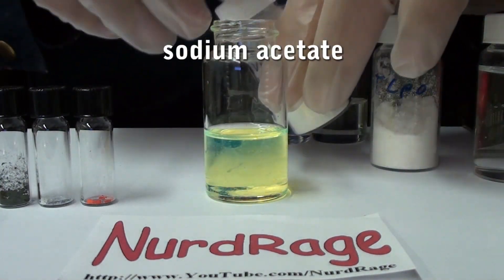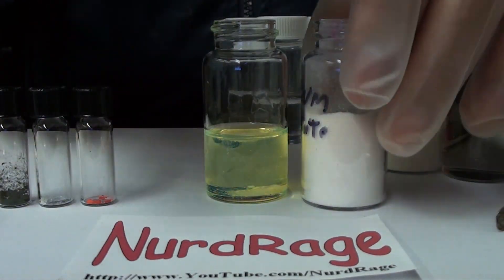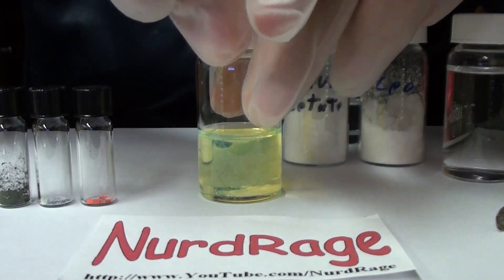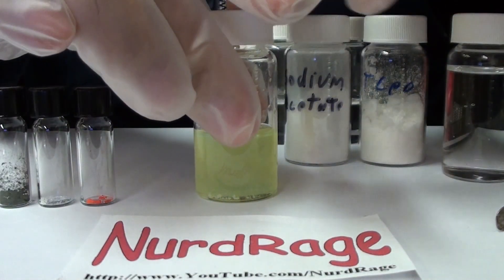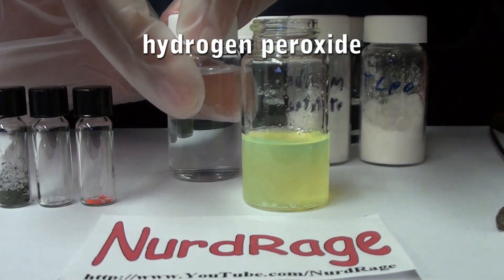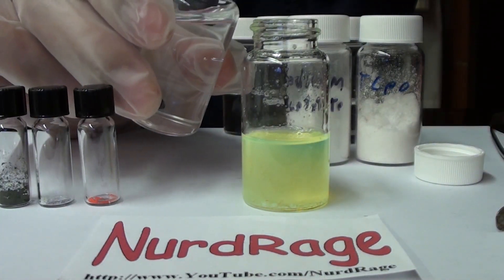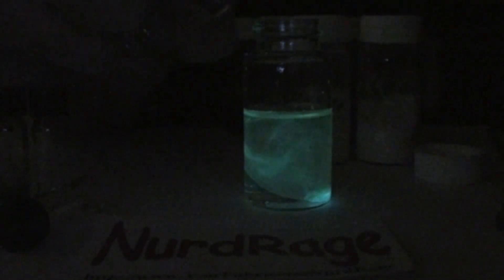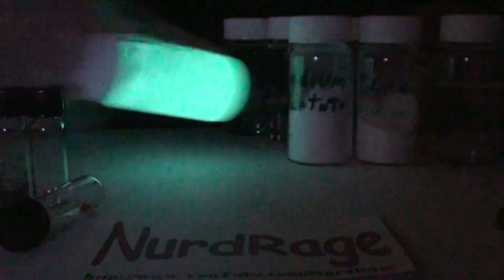Now I'm adding sodium acetate as a base. This reaction works better in alkaline conditions than in acidic conditions. Sodium bicarbonate and sodium salicylate also work if you don't have sodium acetate on hand. The final ingredient is hydrogen peroxide. This reacts with the TCPO and decomposes it, generating the chemical energy that transfers to the dye and gives it the glow. It's not fully mixed but it's already starting to react. And that is a green glow stick.